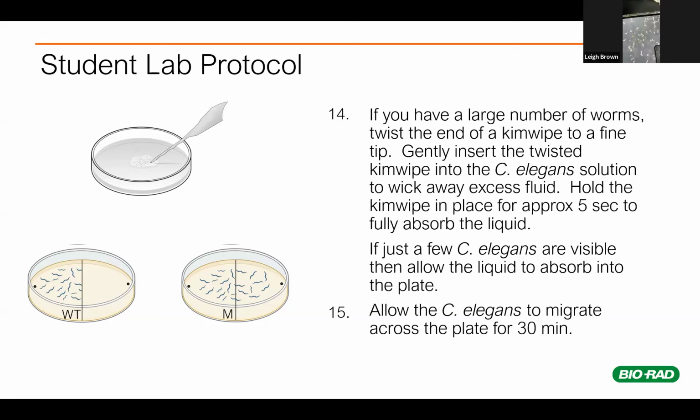I will say that with the iPhone 14 Pro, you don't need the macro lens. It really doesn't do that much. But you can see it works really great with the older iPhones. These macro lenses that Lee's talking about, like she said, are relatively inexpensive. I used to be able to get them for 50 cents a piece on Amazon, but now I can usually find them under $5 for the cheapest ones, which are the ones I buy.